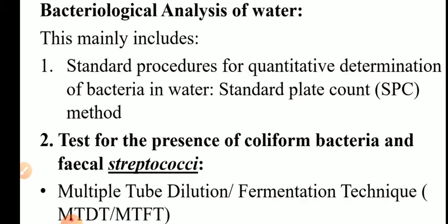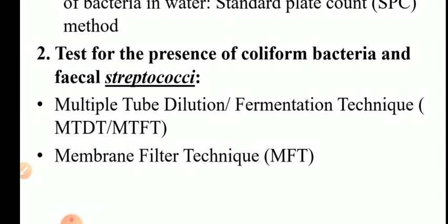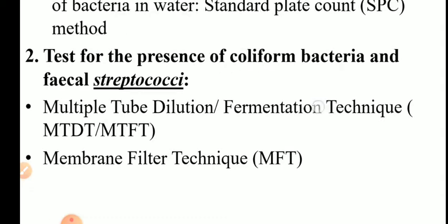So bacteriological analysis of water includes various tests. For quantitative determination we go for the standard plate count method. If we want to test the presence of fecal coliforms or fecal streptococci, then we perform the multiple tube dilution technique, also called the multiple tube fermentation technique, and the membrane filter technique, MFT, for fecal coliforms and for fecal streptococci. Today we are going to discuss the multiple tube dilution technique for detecting the presence of coliforms in water.